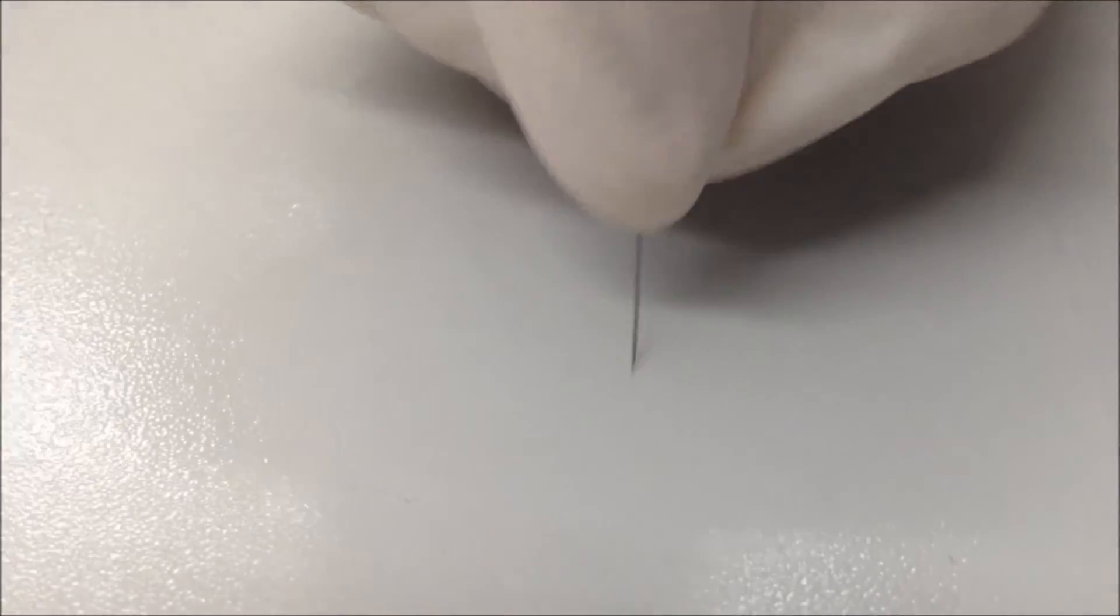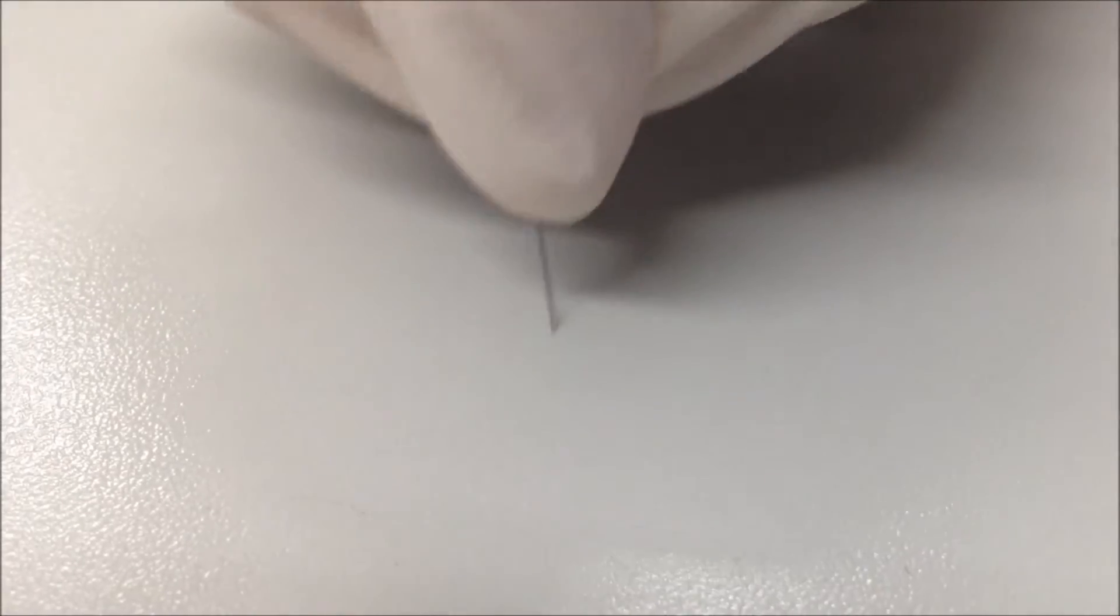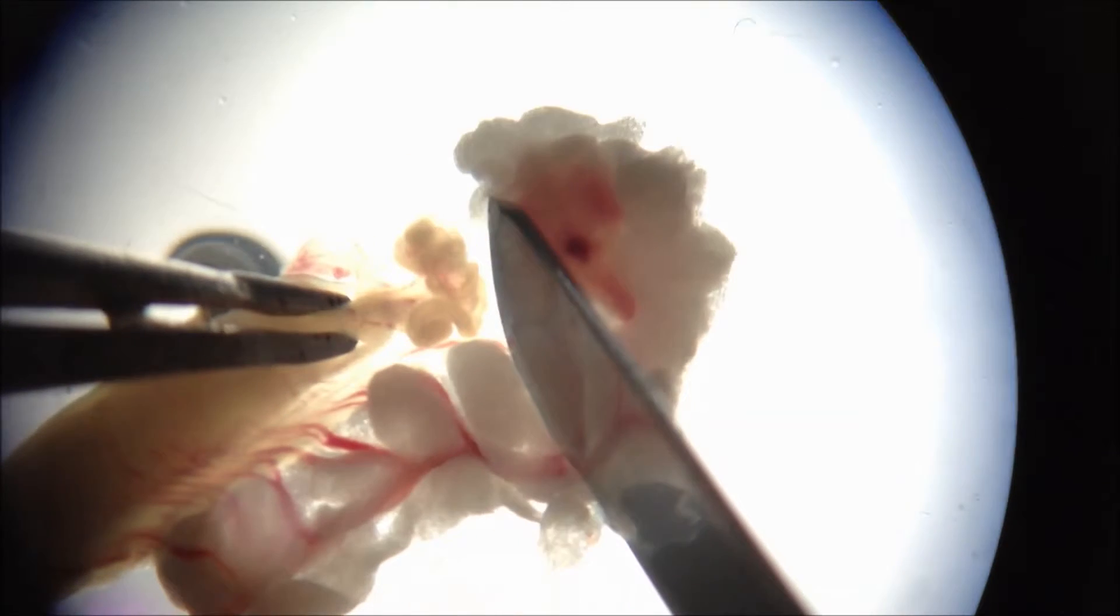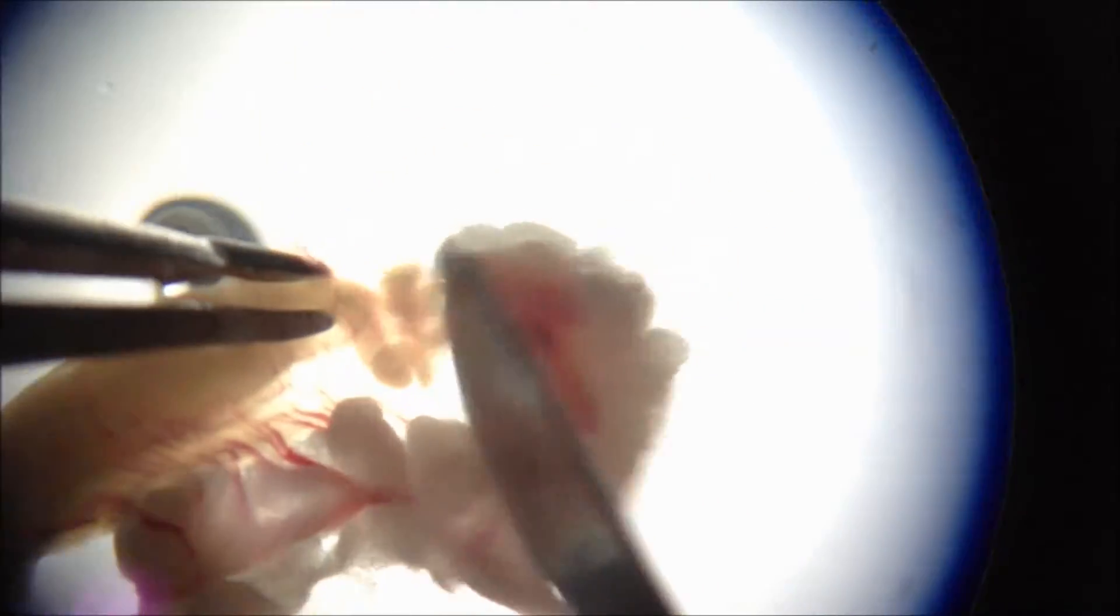Firstly, smooth out the edge of a 0.3 mm needle on a clean surface to facilitate penetration of the oviduct. The ovary and the uterine horn must be removed in order to work only with the oviduct. First, remove the ovary and then continue with the uterine horn.